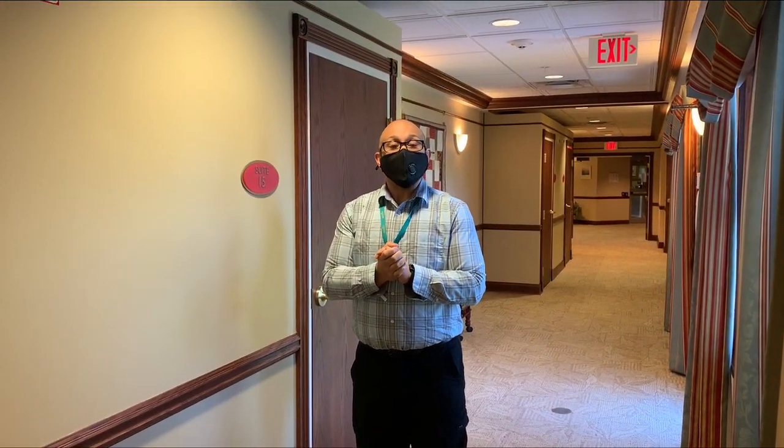Hi, thank you for joining us today. Today we're going to be talking about going into and leaving an isolation room that is an airborne precaution. We're going to be talking about the correct procedures on how to enter, gown up, and de-robe. So come with me and we'll explore what you do next.